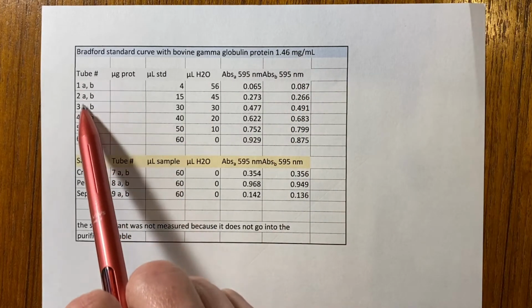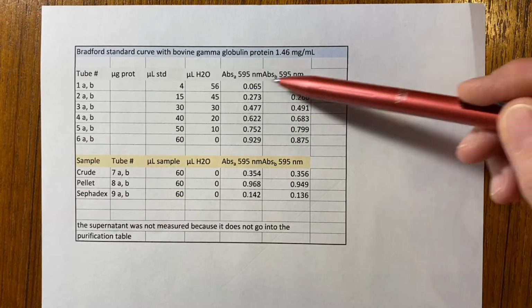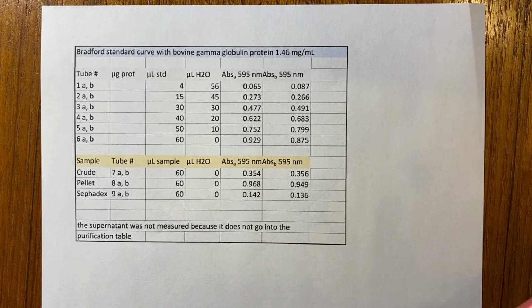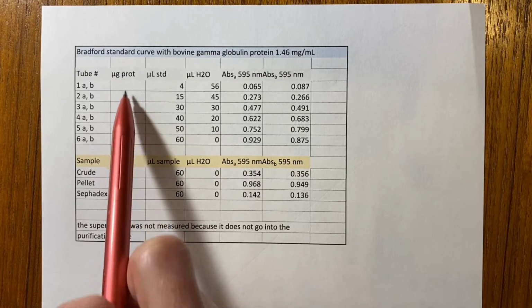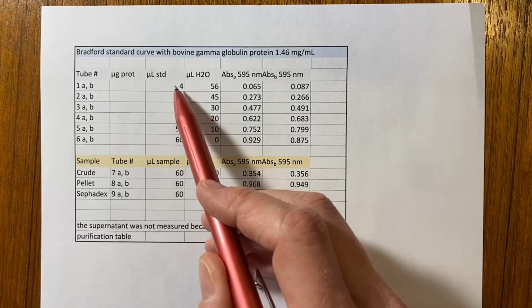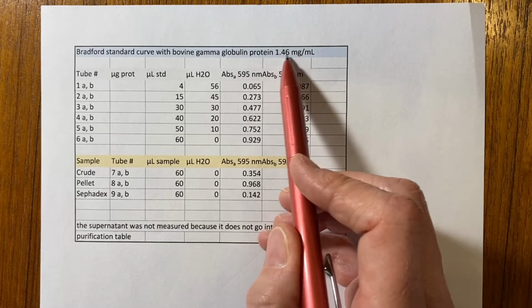And we did it in duplicate for 6 different samples. The duplicate absorbance measurements are here, so you'll have to average those. And those will be your Y values that you plot. And then your X values will be the micrograms of protein. Notice this column is empty, and I left that empty so that you could calculate those. Here are the volumes that you used of that standard protein, and here's the concentration.